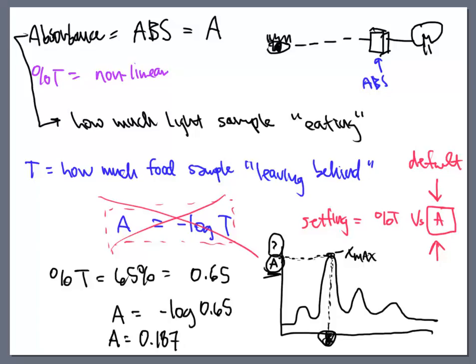These absorbance values have proper ranges. The plates can only hold so much food before they begin to topple over. We don't like it when compounds have too much food on their plate. So the working range of the absorbance values goes from about 0.1 all the way to 1.5 absorbance. Those are my absorbance values that I would really like to see on a spectrum.